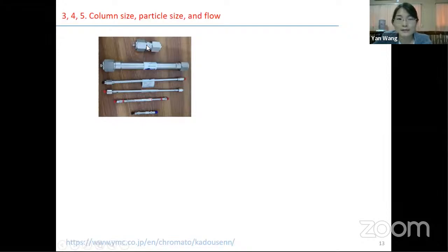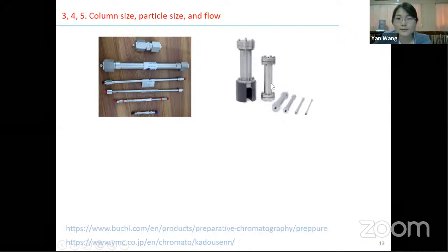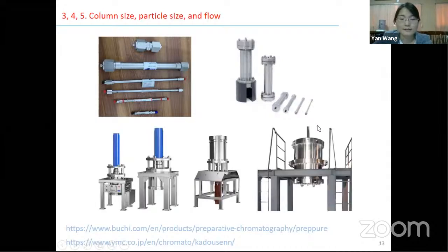Before this column, this small one will protect it. And then from here, you can see the preparative HPLC. This is actually bigger, right? Then what's this? Oh God, this is a huge, big column. And the one on the right is like the industrial scale in the factory. Because it's too big, someone has to climb in from here and go here and work on this part. Like 4 or 5 people can stand on this plate. You can imagine how big it is.